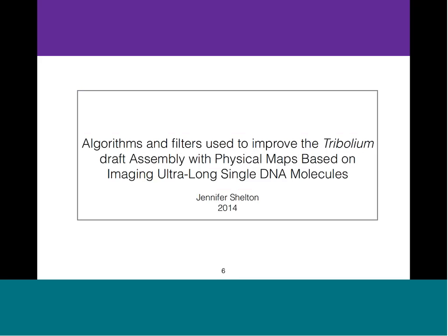Hi, so I'm Jennifer Shelton, and I'm just going to be talking today about some algorithms and filters that we developed here in conjunction with the BNG software to improve the Tribolium draft assembly, and we're using BNG physical maps to do that.